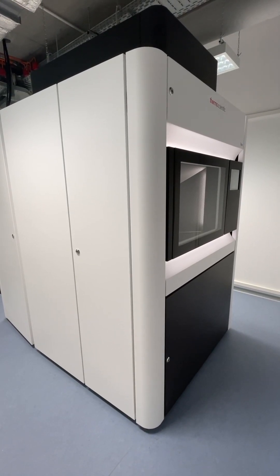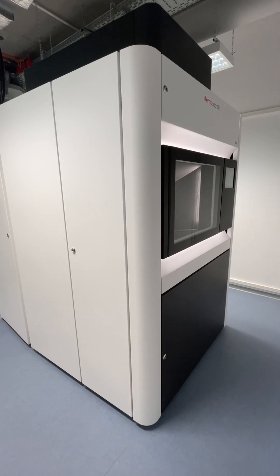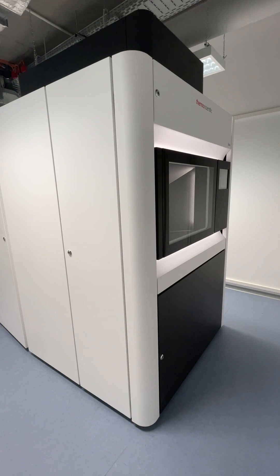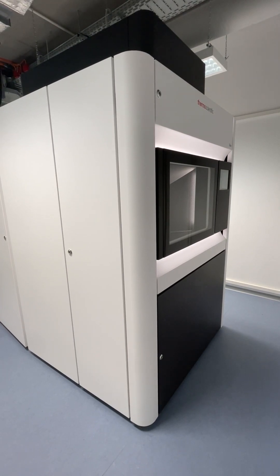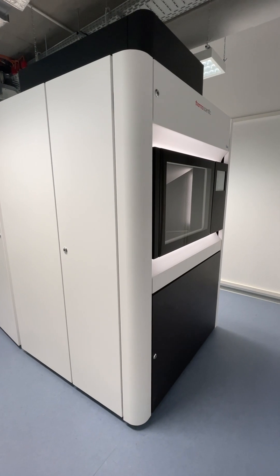Hi everyone. We're looking at the Thermo Scientific Talos F200X TEM with STEM capabilities. This is at Goethe University in Germany, where I have my new job.